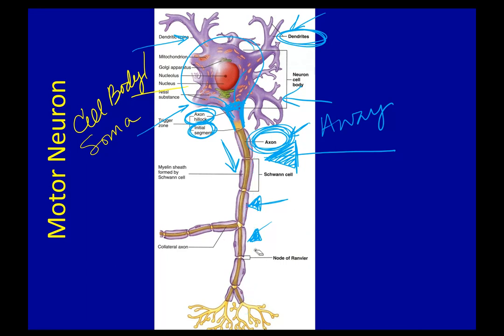So having ACE bandages wrap around it to give it physical support is not a bad idea. Like I said about the neuroglia before, their job is to take care of these cells. Well, these Schwann cells that are making the purple tamales are actually doing that. Physically they're supporting them so that they don't end up being damaged if you bend your arm or you bend your leg.